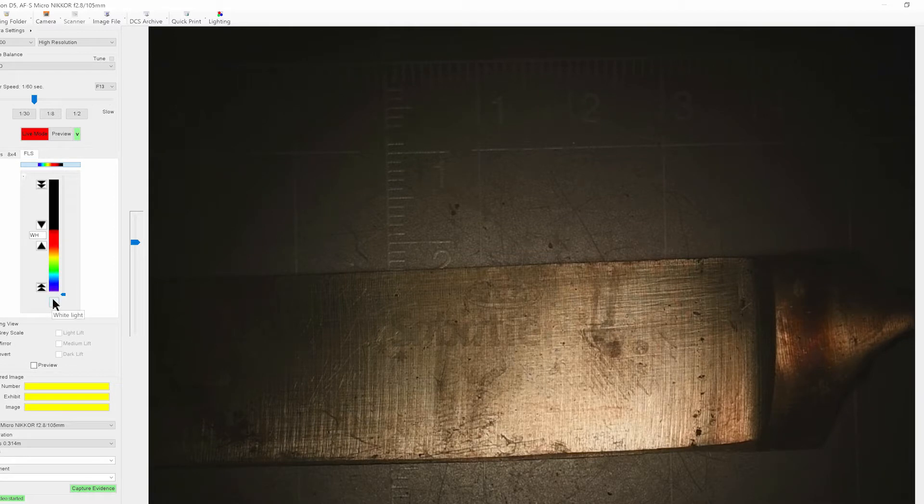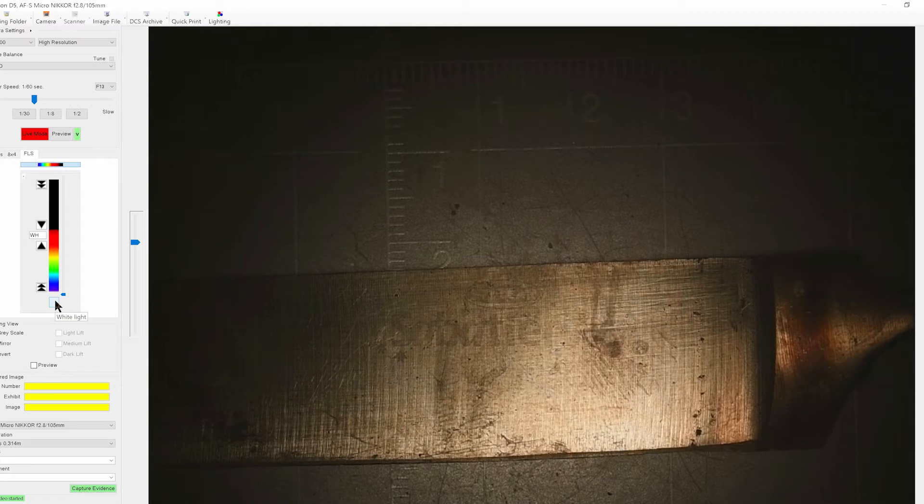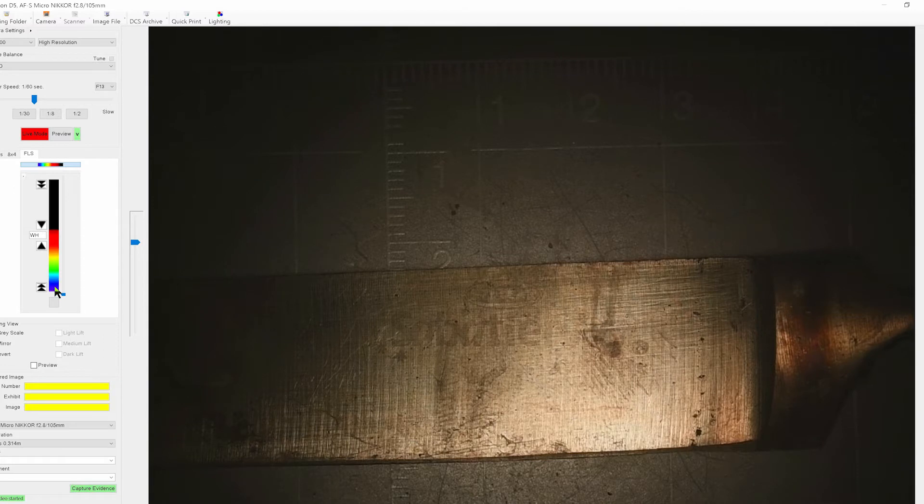Now what we can also do is one of the options is you have full spectrum analysis on the DCS-5. So we can use white light but we can also use a range of colors from the UV through the visible and even into the infrared.